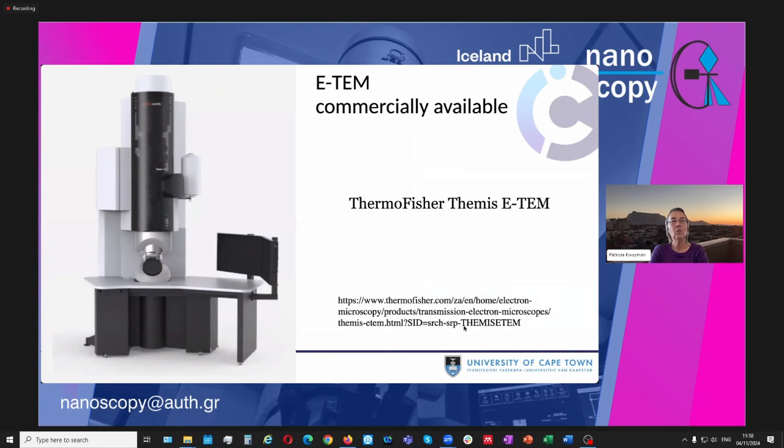That small white box on the left is all that you see now, close to the microscope. And of course, all the controls are now integrated into the microscope user interface. But this doesn't show how much additional stuff you actually need, which of course the old machines showed very clearly.